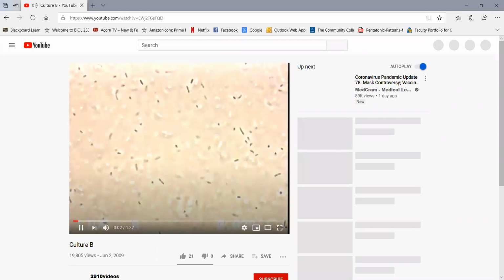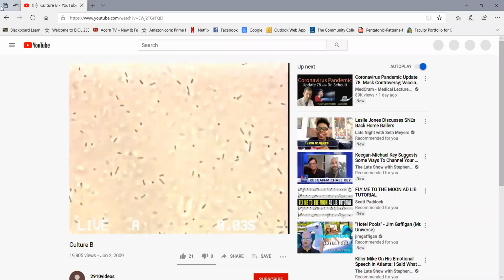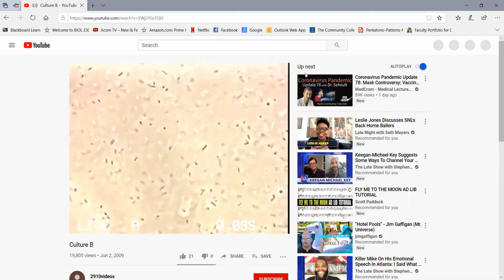So notice here that when the organism is in focus, it appears darker than the background. And when the organism is not in focus, then it appears light. So notice it swims in and out of focus, but notice we see tumbling motility, where the organism, there's a nice run we just saw, we see tumbling, and that's how it, of course, changes direction.